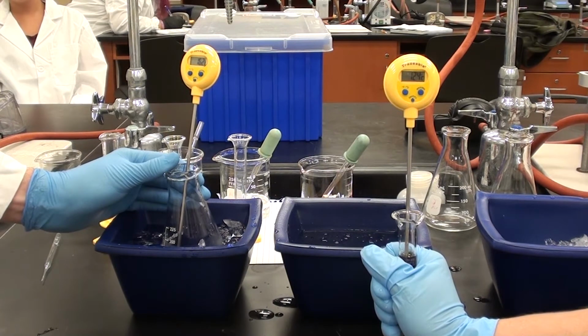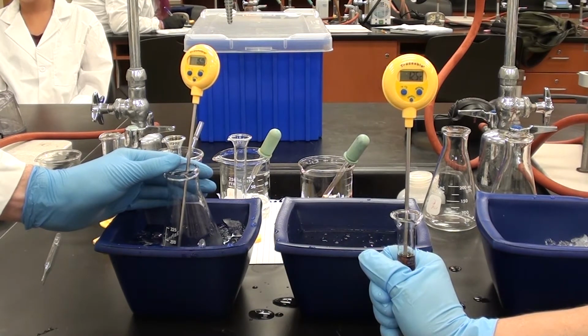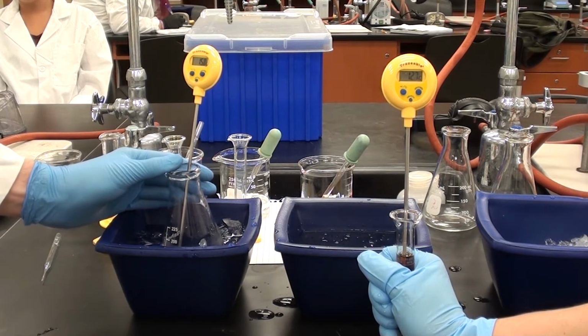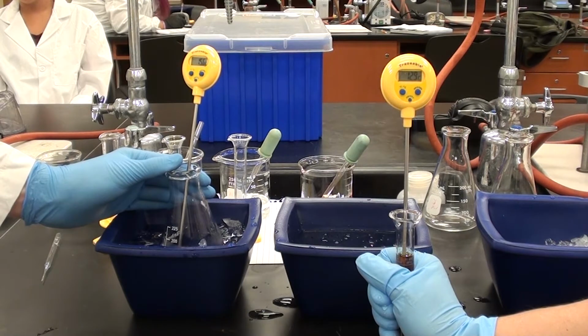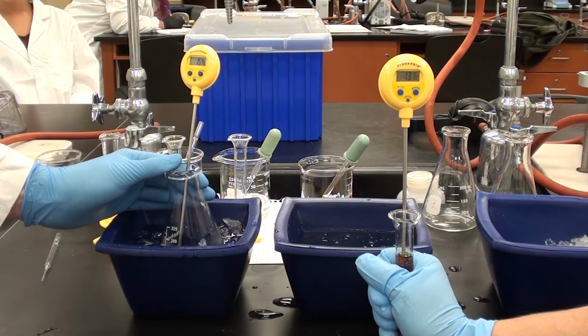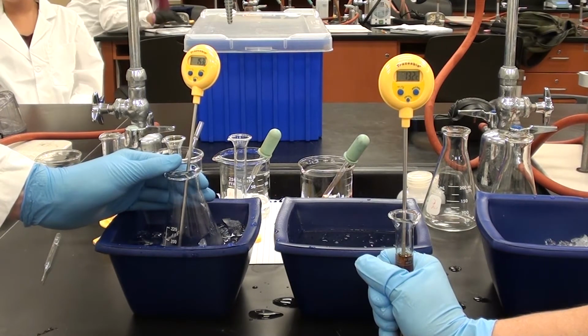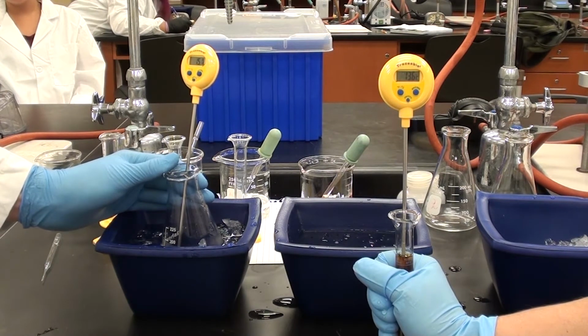And you can see that by her putting her hand around it, it's stopped the temperature from going down and now it's beginning to go up. I'm not really going to try and necessarily get it to a specific temperature. I just want them the same temperature when they're added together. And that'll be your aim as well when you're doing this. So this is getting close to 15. As that's coming down and this one's coming up, once they get to be the same temperature, that's when we'll add them together.